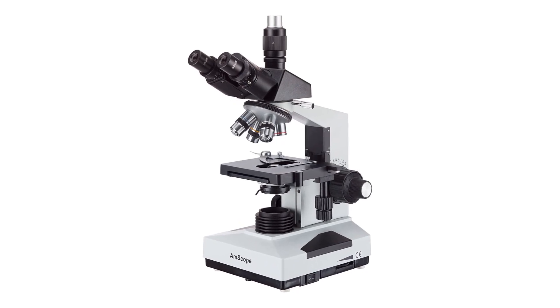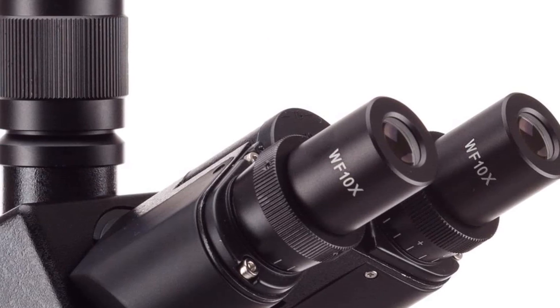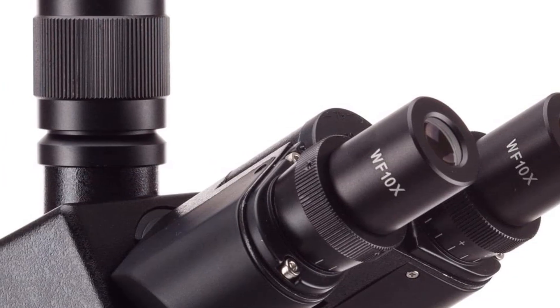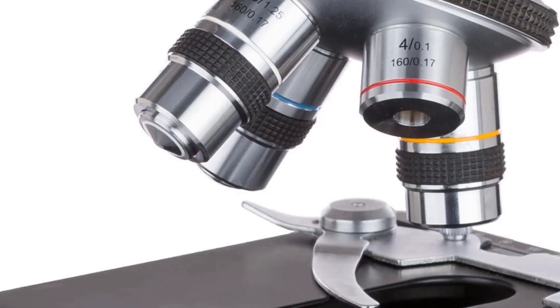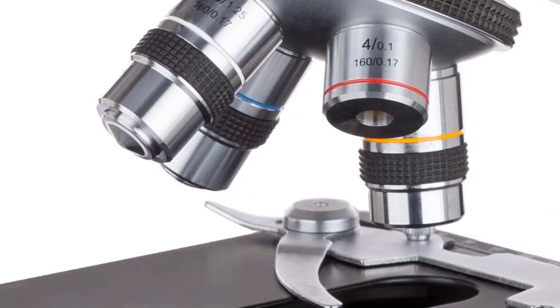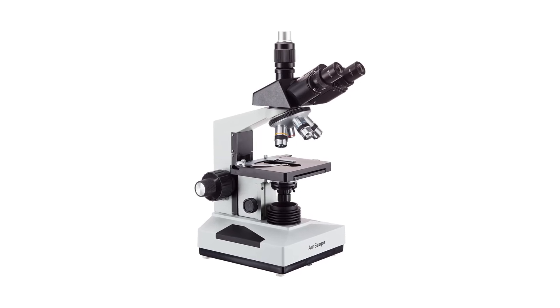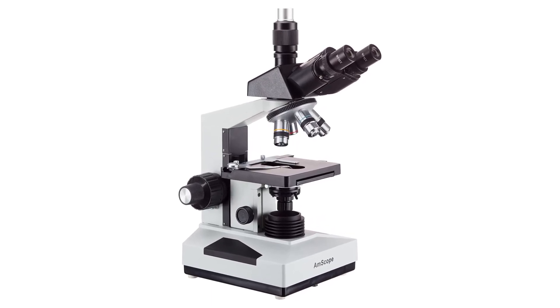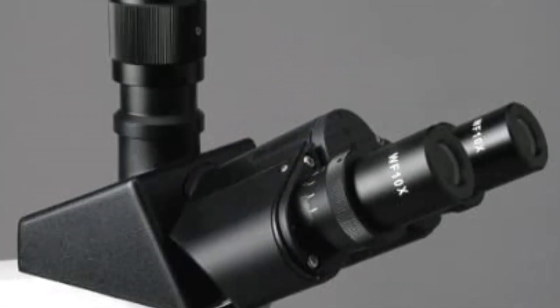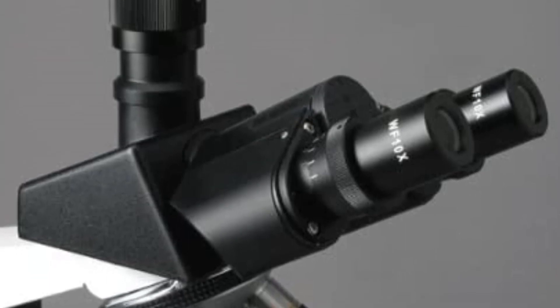Pros: high-resolution optics for clear images, 40x to 2000x magnification capabilities, halogen light for improved visibility, Abbe condenser for enhanced contrast, two-layer mechanical stage for precise sample positioning, and wide-field eyepieces for comfortable viewing. Cons: can be expensive for some budgets, and requires some assembly and setup.